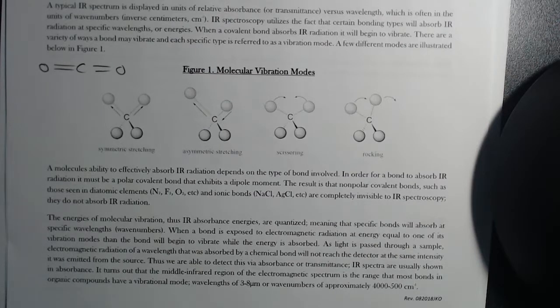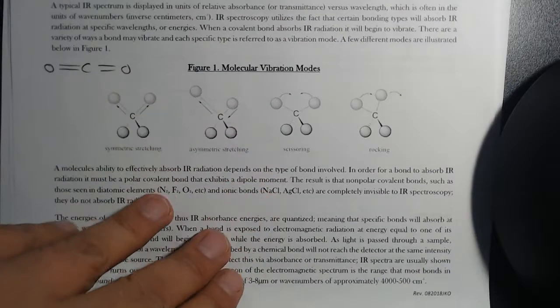But the bad part about it is that it actually shows up where triple bonds do. So you have to be able to recognize a CO2 peak versus a true triple bond peak. And they do look different. We'll see all that stuff today and in lab this week.